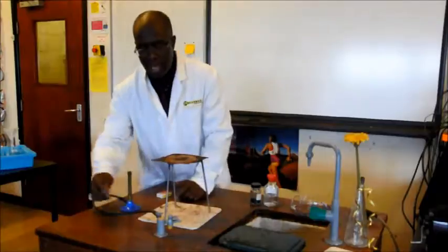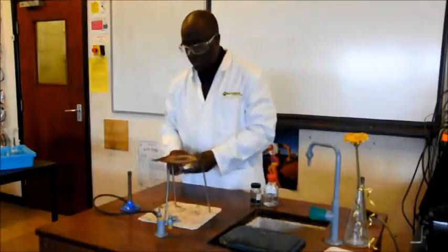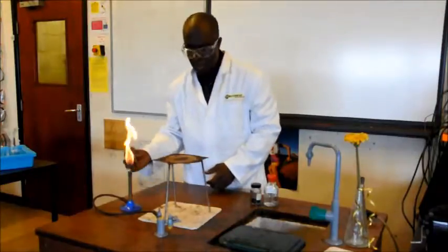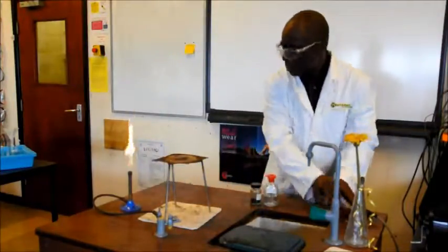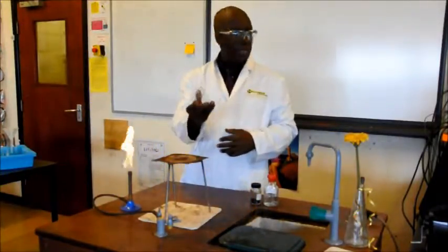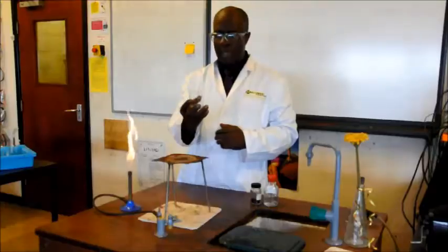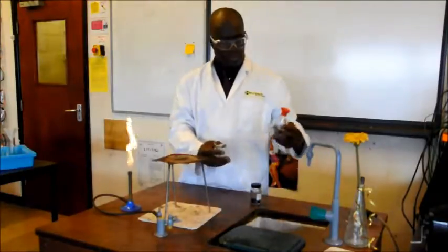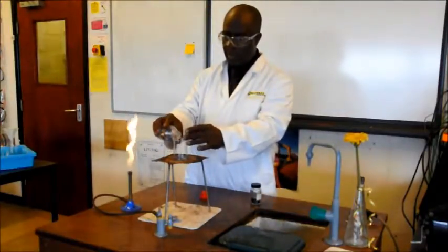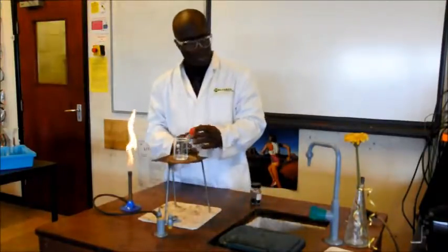Just check that this one works. I'll light it up first. Fine, that one works. We'll start with a small beaker, and we'll need about 40 cubic centimetres, 40 millilitres of the sulfuric acid. So, not quite going to use that much. Pour it in. Sufficient for my purposes today.